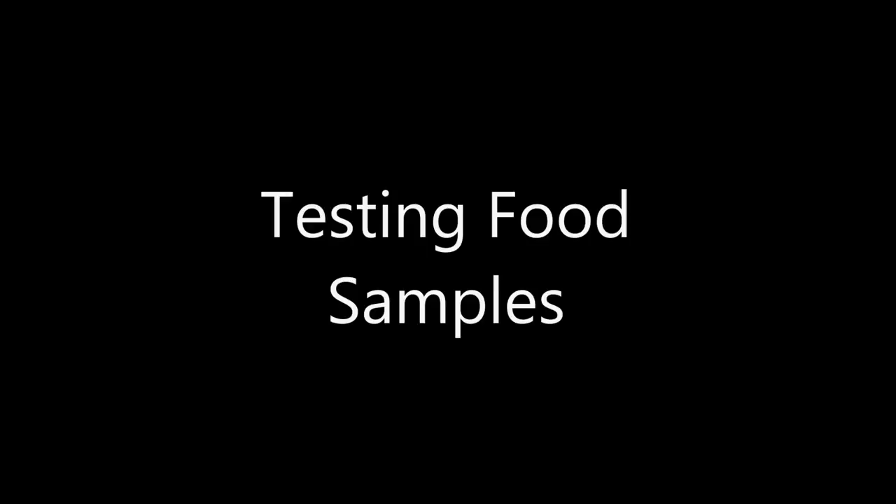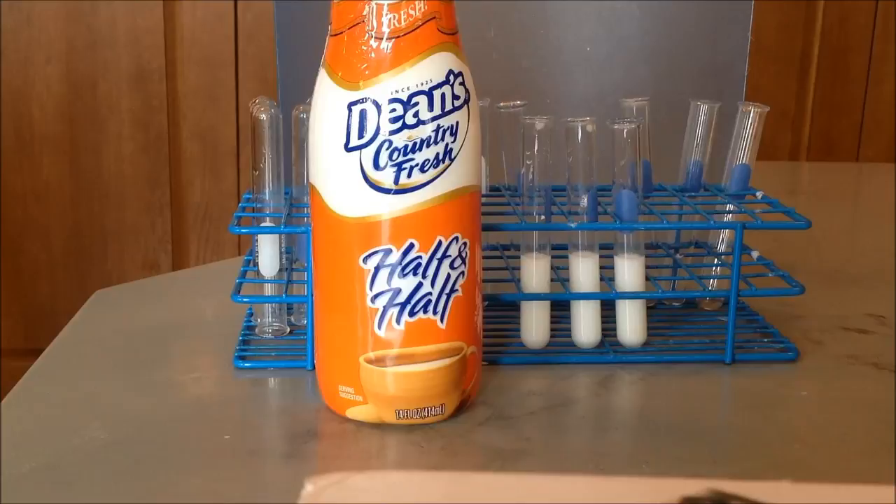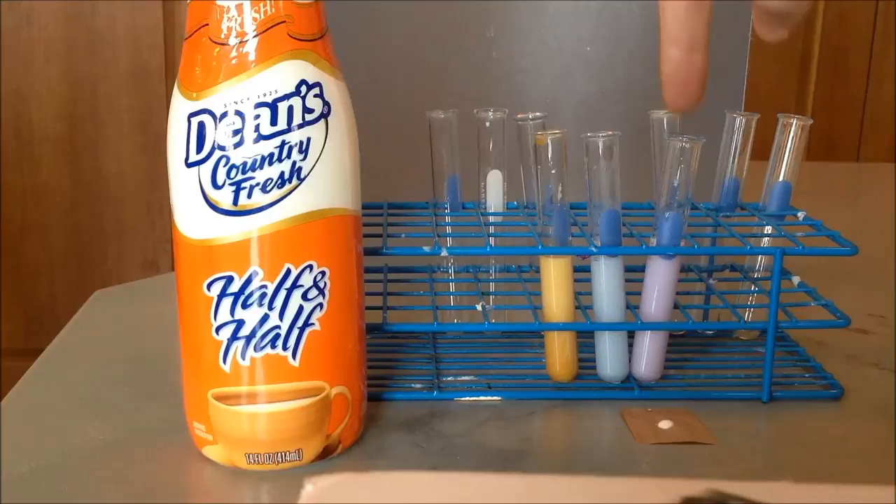The first food item is half and half, and you can see the three different tubes we'll be testing the half and half in. Here are the test results for the half and half. The first one is with the Lugol's iodine, then we have the Benedict's, then the biuret, and then the lipid test.